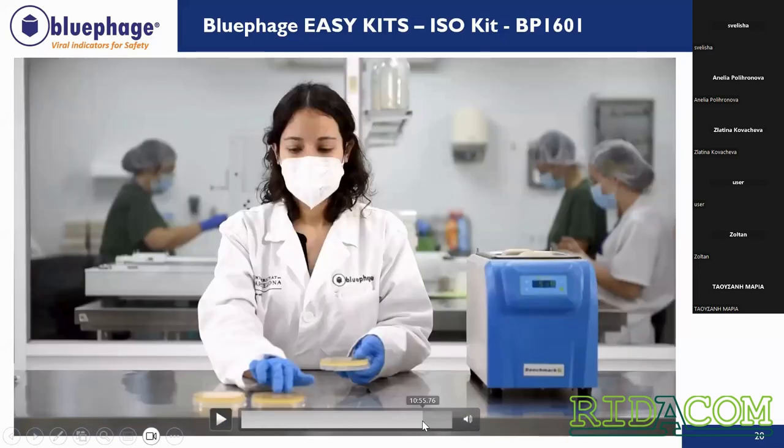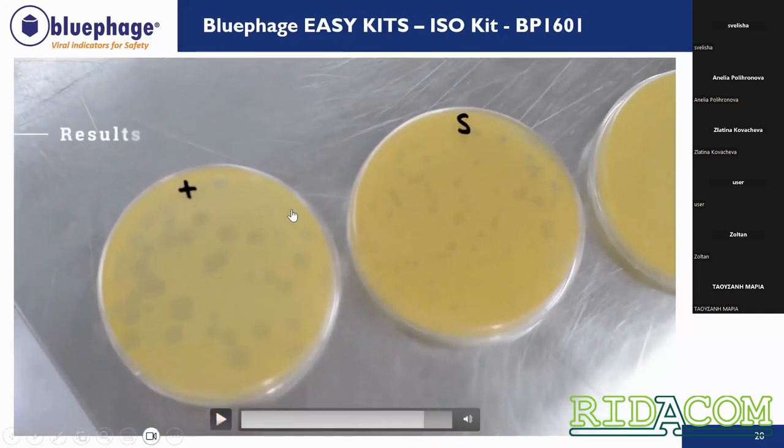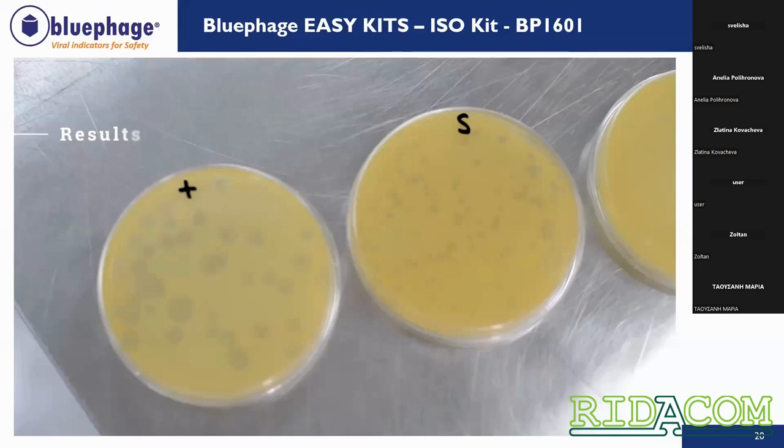Okay. As you can see, we have a layer of the bacteria alone, and we have some plaques. These are the plaques that we need to count, okay? So in our positive control, usually the plaques have approximately the same size, because we are using the PhiX 174, but in your environmental samples you will have plaques of different sizes. So you need to expect different sizes of plaques, because each bacteriophage, each coliphage has different sizes, grow differently.